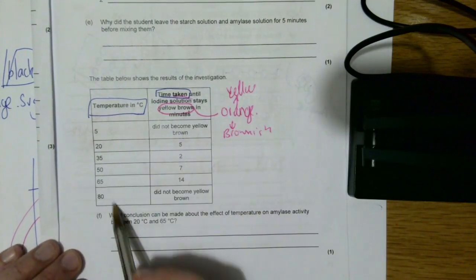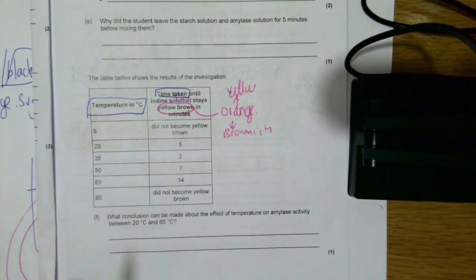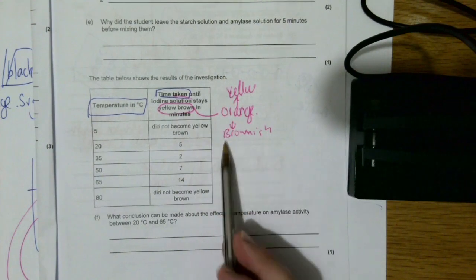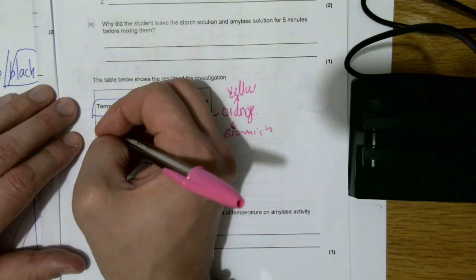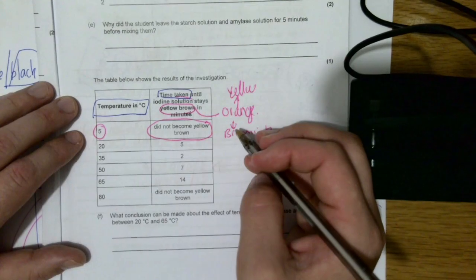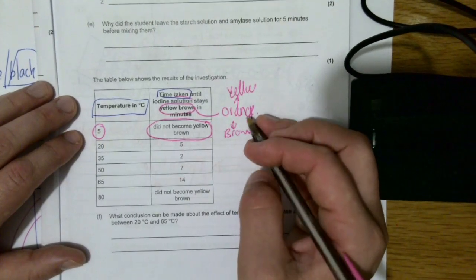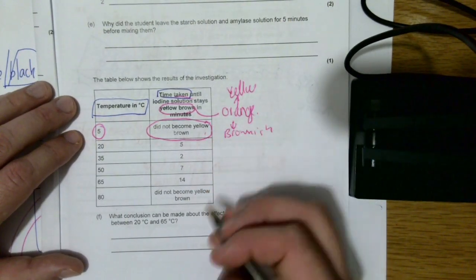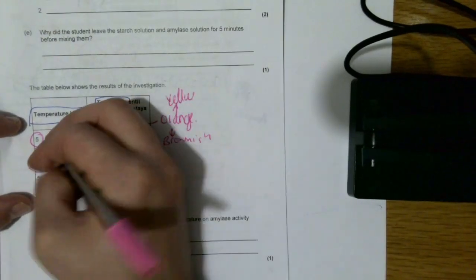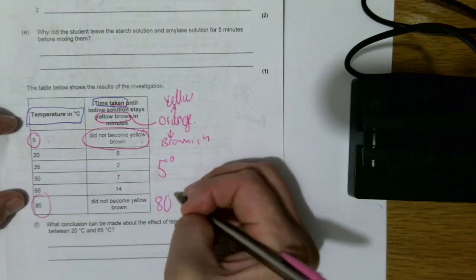So what we're doing is we're changing the temperature and then we are measuring the time it takes for the starch to be broken down, which is where it goes from black to orange, or here yellowish brown. Now, if we look, 5 degrees did not become yellow brown. That means there's no glucose present, which means that there is no breakdown of starch. It remained black. This question asks us to explain the result at 5 degrees and the result at 80 degrees.